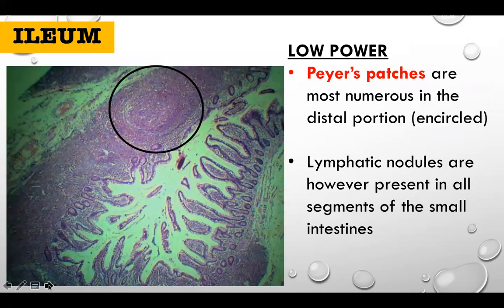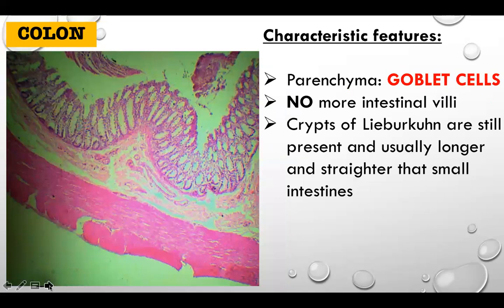Peyer's patches are most numerous in the distal ileum. In the colon or large intestine, there are no more intestinal villi. The crypts of Lieberkühn are still present but longer and straighter than in the small intestine. The parenchyma of the colon are the goblet cells, which are very numerous. There are no more Paneth cells in the large intestine.